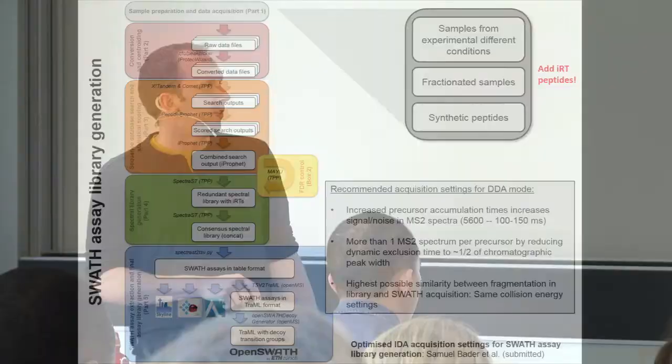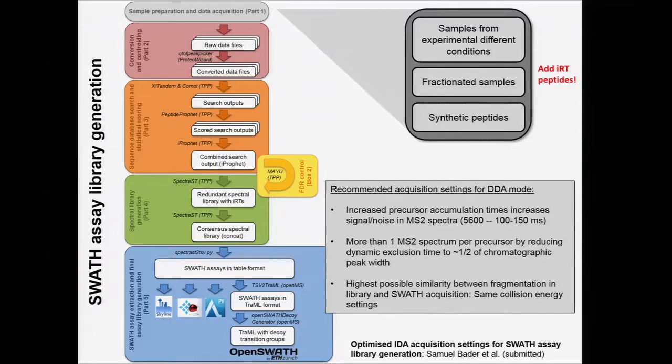It also can be beneficial to collect more than one MS2 spectrum per peptide, because this idea of averaging spectra or making consensus spectra helps you with this signal-to-noise problem as well. The representation of the relative fragment ion intensities when you sum over more spectra for the same peptide is going to improve too.